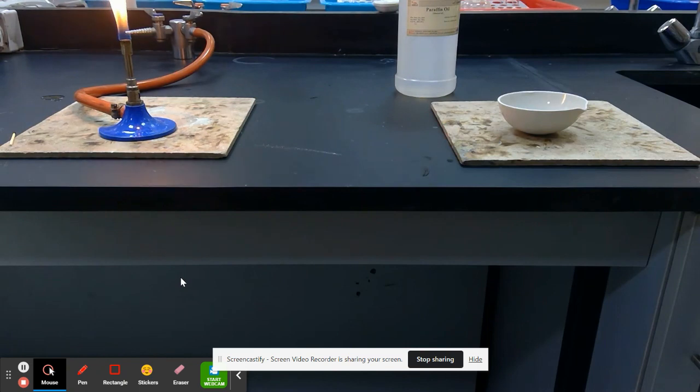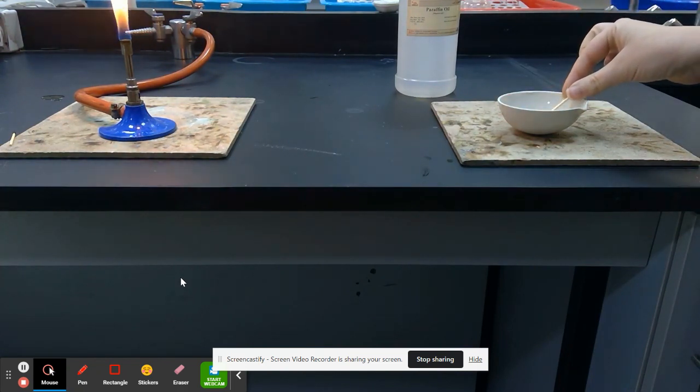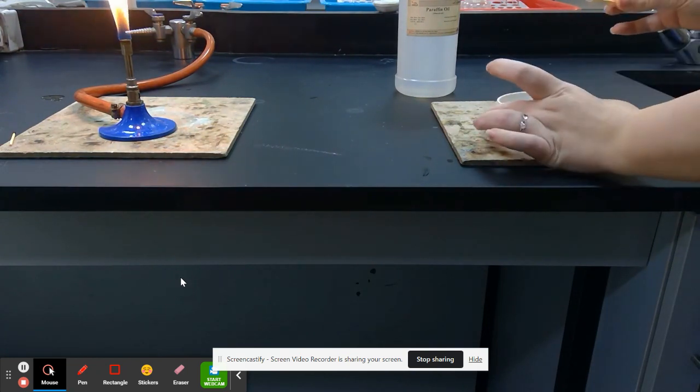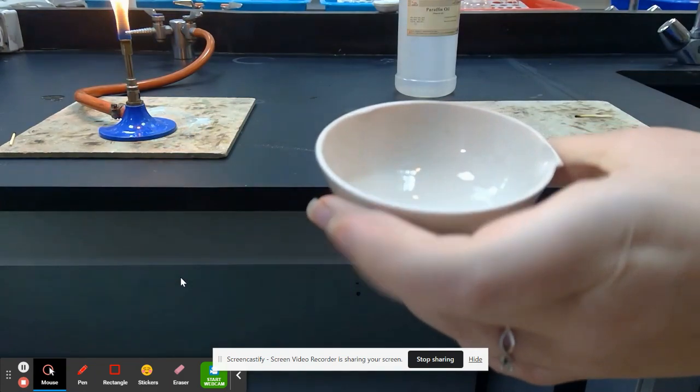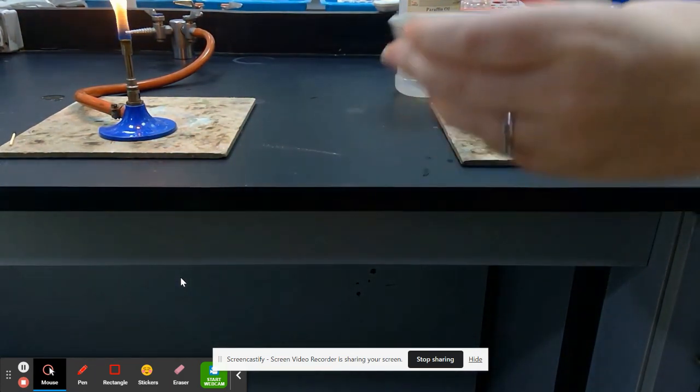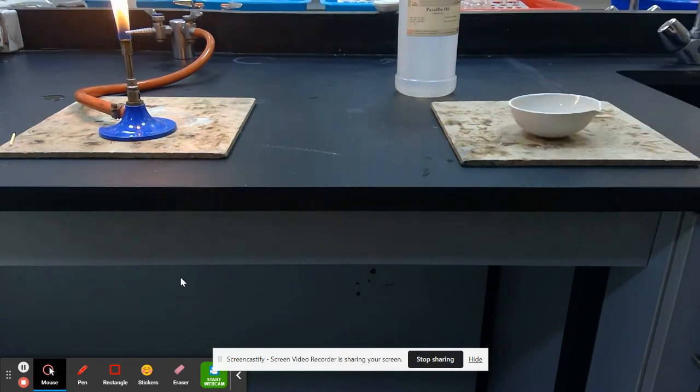Whereas if I do the same thing for paraffin oil, you can see that it just puts the match straight out. I'll go again, bring it a little closer. So you can see absolutely nothing happens there. So paraffin oil, not very flammable.